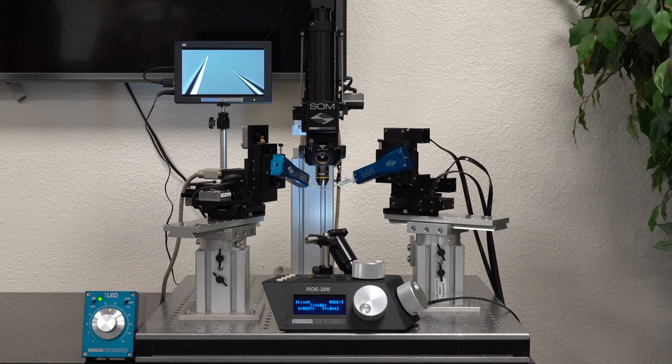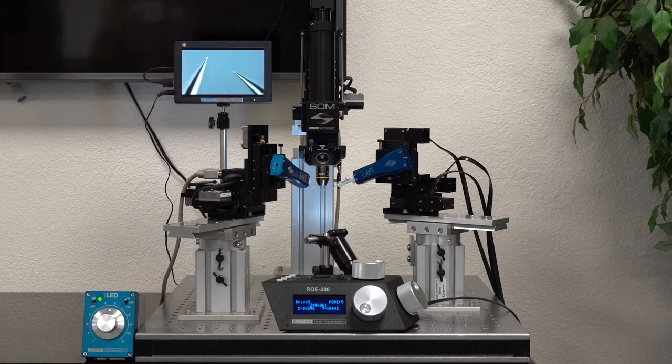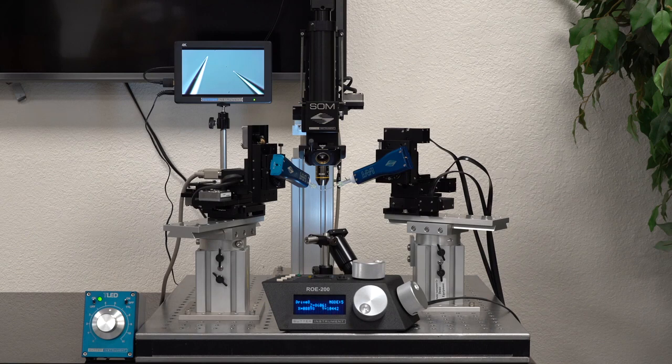The fluorescent excitation port is on the left side of the microscope, here. A light source can be attached with either C-mount threading or 30mm cage components.